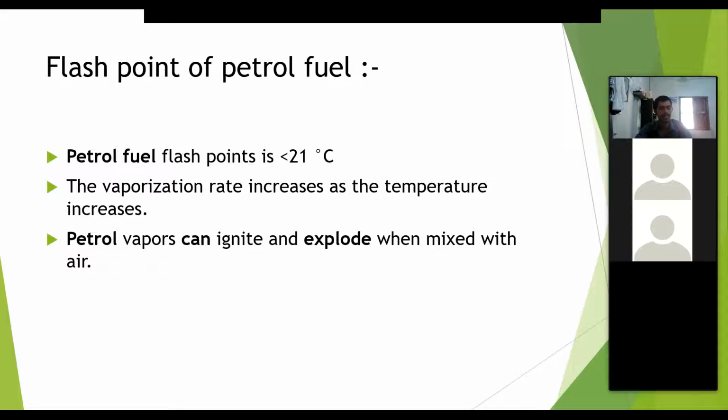So we have done it at our room temperature, and you can see what happened. We have recorded a video, and you can see as we do this flash point test for this petrol fuel, our temperature was 30 degrees Celsius. When we were doing the flashpoint test, we knew that the sample had already passed the flashpoint, and at that room temperature it reached the fire point also. So it started to burn actually. We have recorded videos, and I will show it to you.